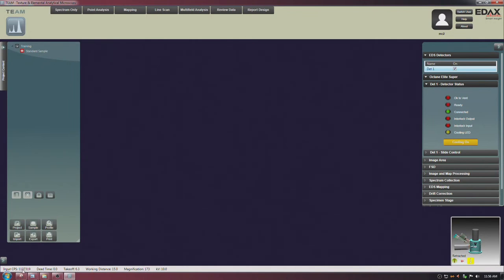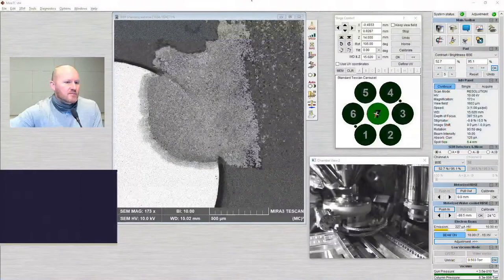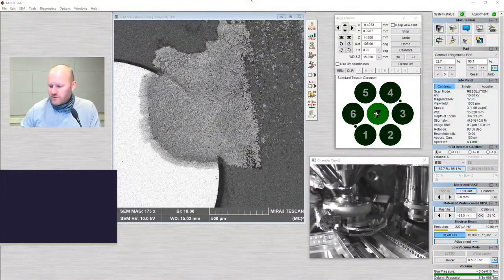Very important numbers here: one is input CPS — counts per second. There is a question about how to measure the diameters of the spheres — I can definitely do that while we're waiting for the detector to cool down. The detector should cool down in just a few seconds. Let's go back to the hand panel and go back to field mode so I can easily navigate. Let's drive over back to the spheres.